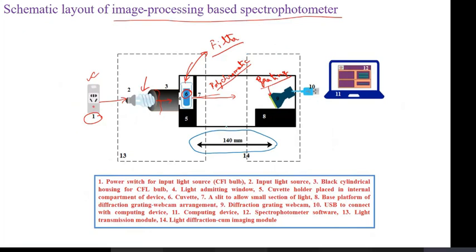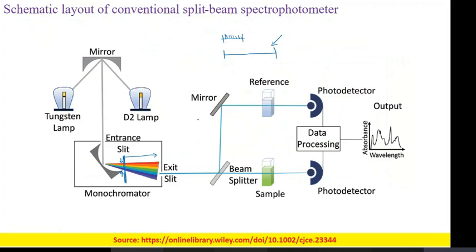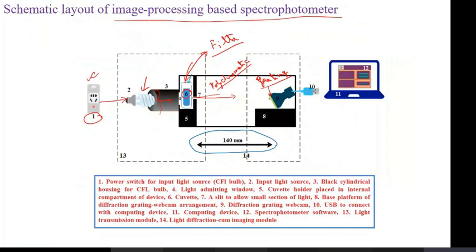And when you talk about this sample holder, it is acting as a filter. We have already shown that it is acting as a filter. Now if you remember from our single slit setup, what this filter does is it tries to make all the light incident onto the grating in a concentrated way. Here also you have to find a fine sweet focus point, because we are not using any filter over here. I told you it is acting as a filter, but it is not an actual filter. So we have used an exit slit over here, so a narrow beam of light is coming and falling onto the grating.